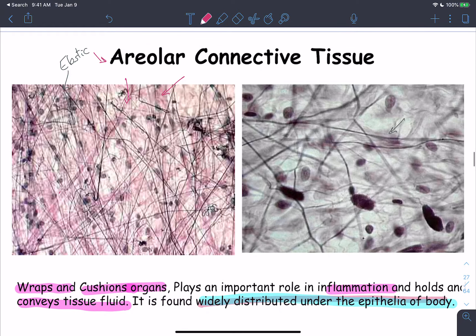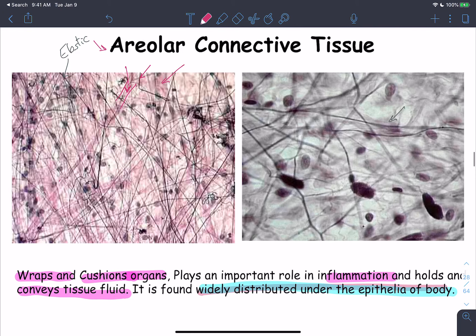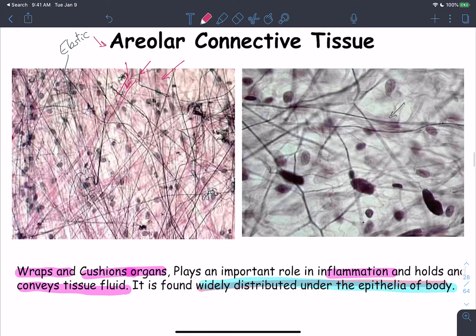Moving on to connective tissue: areolar connective tissue contains collagen fibers, thin darkly stained elastic fibers (long fibers), and many spaces in between. The areolar connective tissue allows fluid to travel up to the epithelium and is widely distributed under the epithelia of the body.